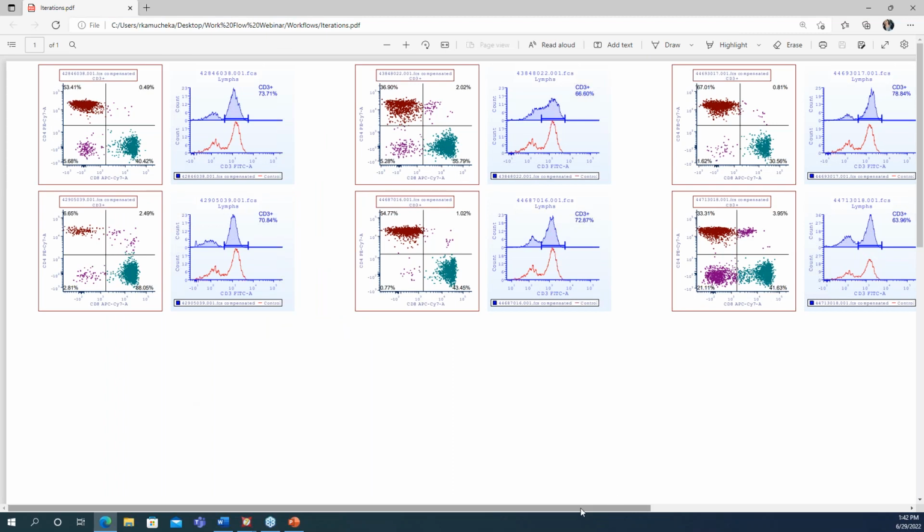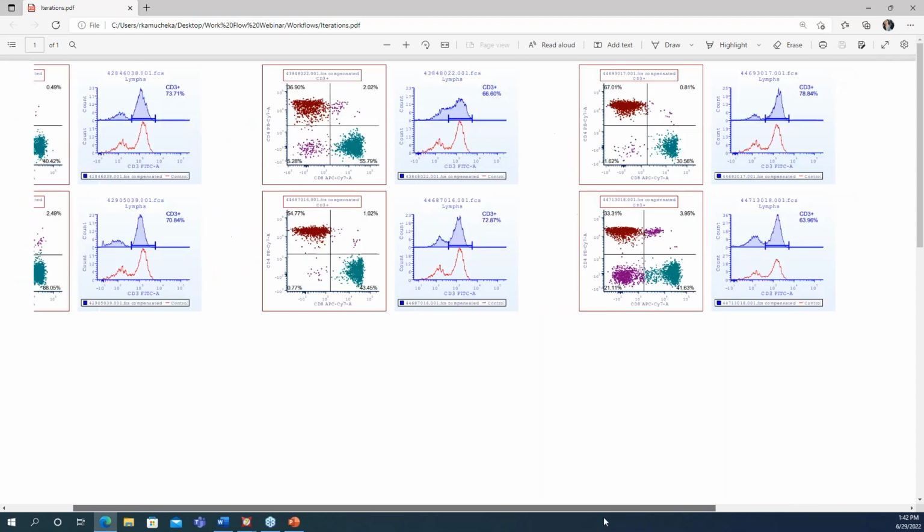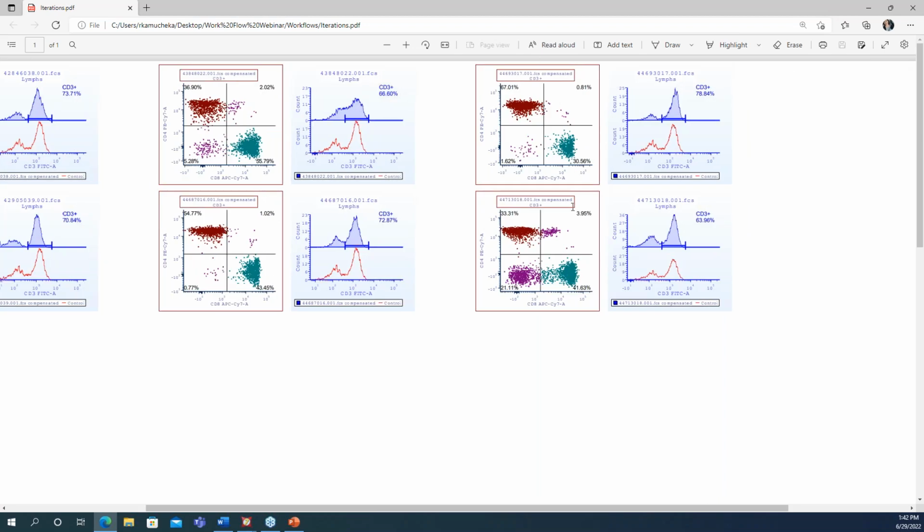So I have 3 iterations, and all iterations include 2 data files. And I get this nice report. I can see each of these data files side by side, and I can look through each of the iterations to see what's changed. Maybe one was a test, one was a control, one was 1 hour, one was 3 hours. Nice comparator to see those things side by side.